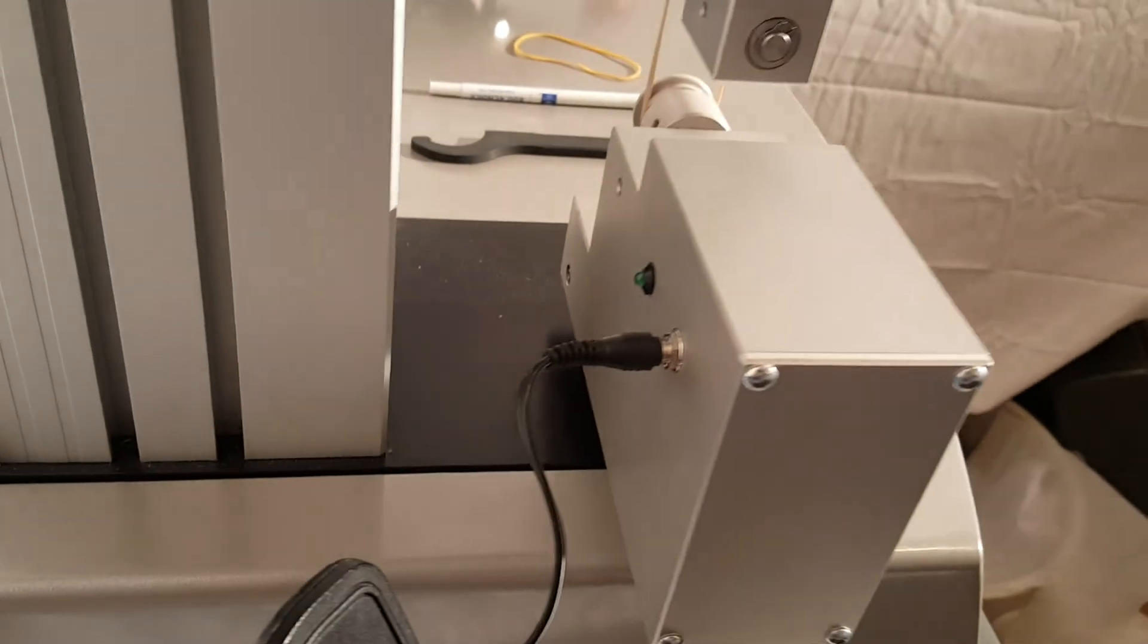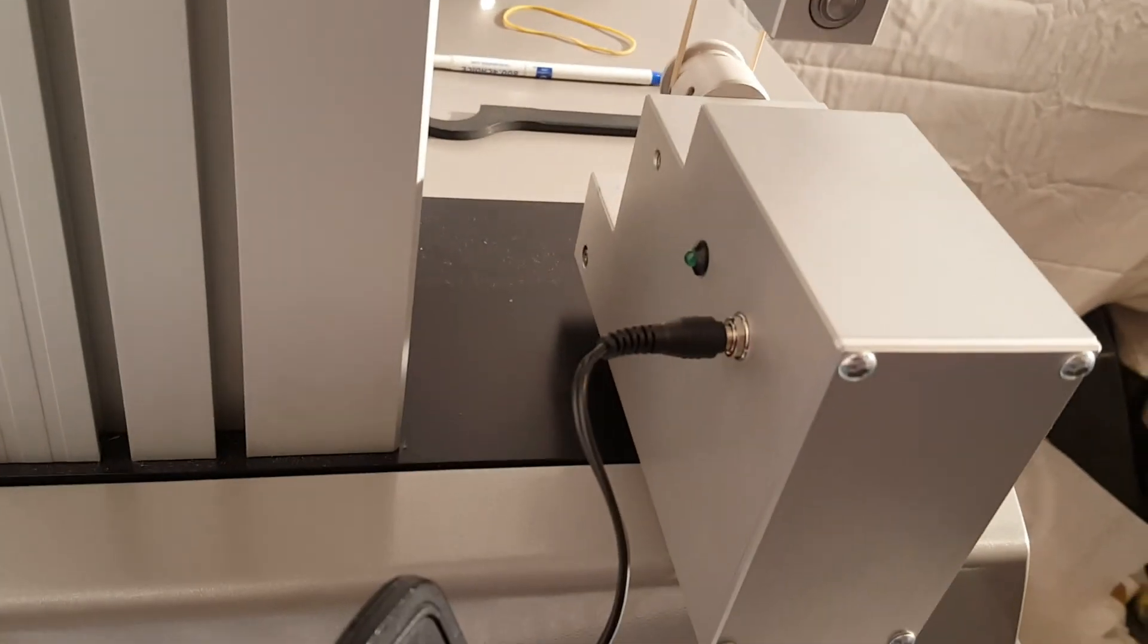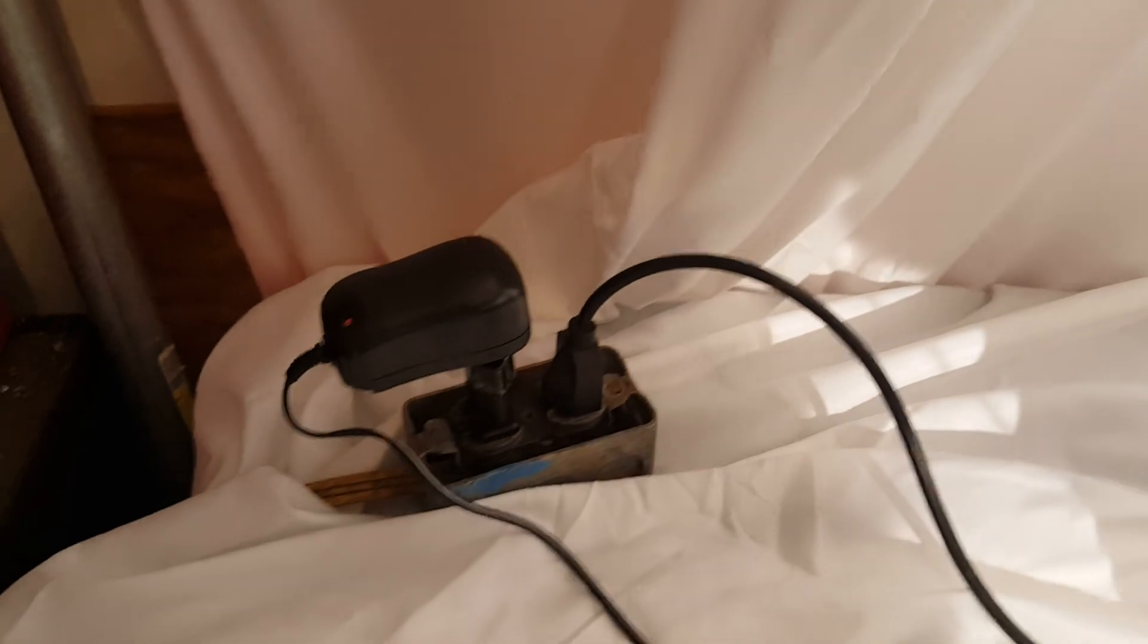The electrical setup is also pretty easy. You can see I have it plugged in back here, and it's plugged into our power outlet. I also have the testing machine connected.